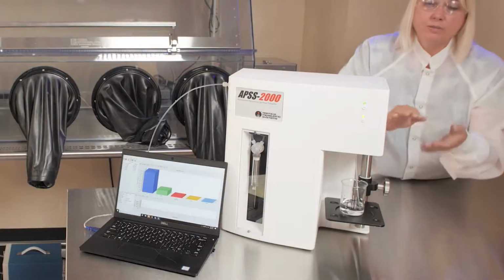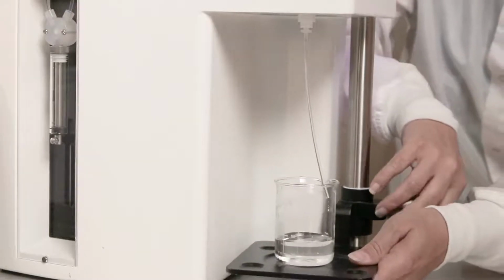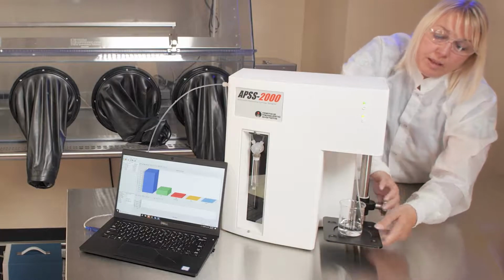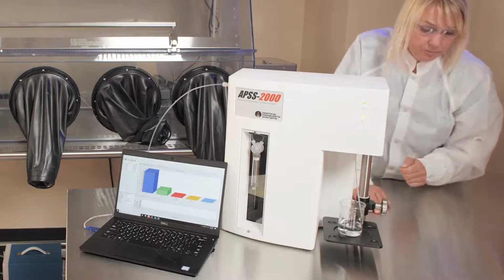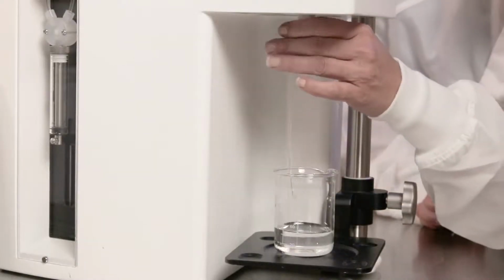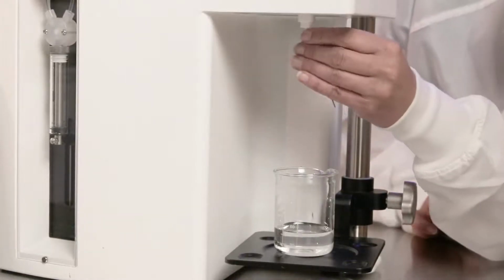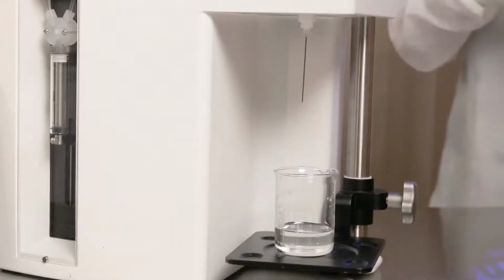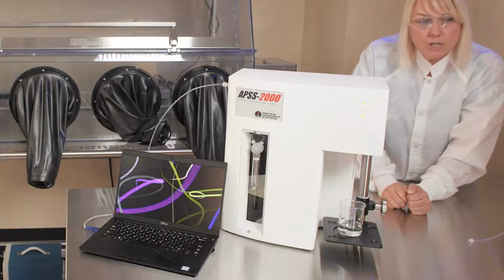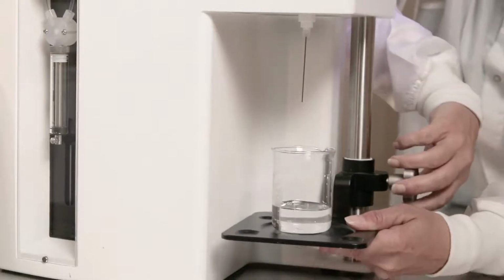The APSS 2000 has an adjustable stand. This can be raised up and down depending on the size of your sample. It has different types of syringes. This is the flexible tubing, which can be easily removed and replaced with a needle. So we have flat needles and then we have a coring needle. The coring needle can be used to puncture a sterile bag. We have different size needles.